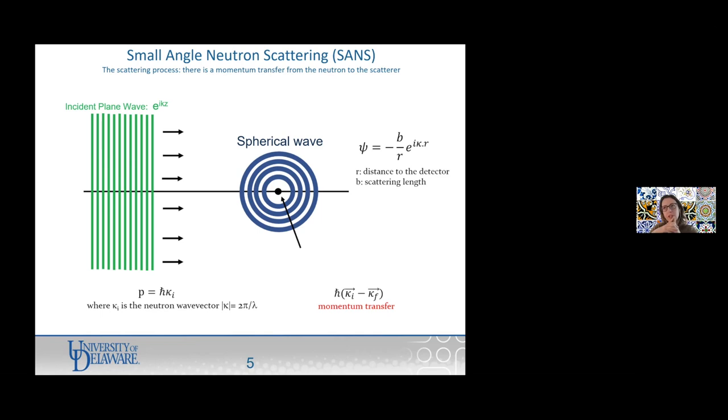So you can infer a lot of information. The other important parameter is the types of interactions that you have, and this is also a very powerful thing about SANS. Not only structure, but we're also measuring types of interactions between different molecules in your sample, which is very important in biology because it controls how the sample behaves, right? For example, the reason why you have aggregation or do not have aggregation is because of the types of interactions that you have between your molecules. For a formulation, this is critical, or for the behavior in terms of phases of your sample.